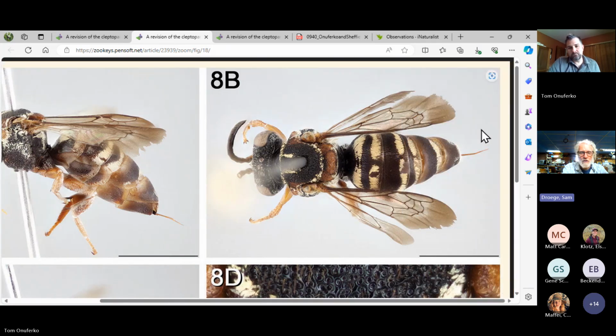that those white appressed hairs often disappear if there's even a little bit of goop on the specimen. And so sometimes you have to really look carefully to see patterns in hair bands if you have a goopy specimen, because you can see those marks there where they've just gone. I think the hairs may be removed, but it's also quite likely they could be simply covered with some junk. I think in that case, it looks like they're removed because I can see the pits underneath in some of the, like on T2, but that is a very good point.